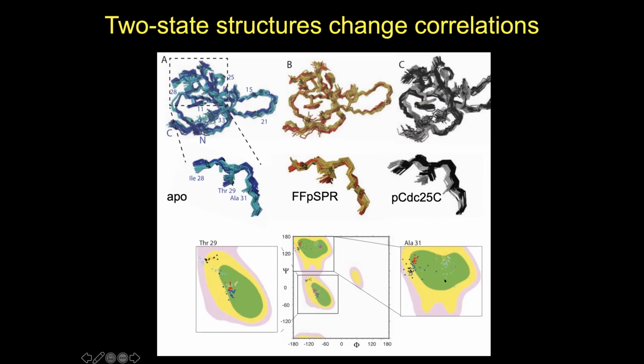You still see two clusters, black and gray. However, when you compare the colors, you see that they are flipped. So this means that we actually observe an anti-correlation. The two states in residue 29 kind of cross over when you go through to 31.